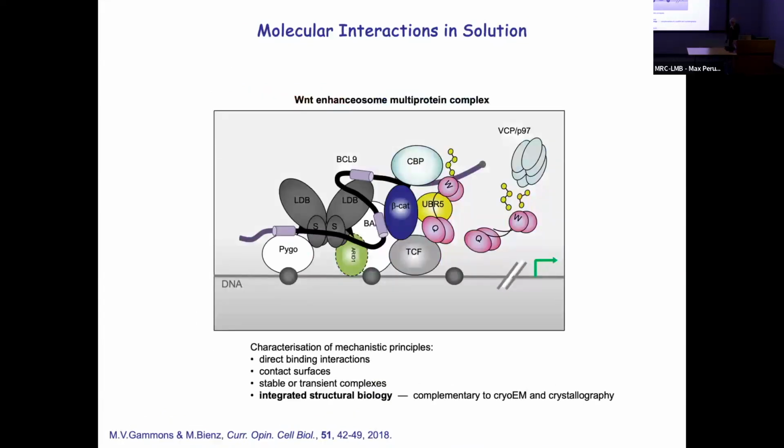So what we have to do as NMR people is push across the alternative uses for what this technique will do. The sort of thing that I'm doing, for example, is looking at multi-enzyme or multi-protein assemblies using NMR to look at isolated pairs of domains. The problem we have is as we go up in molecular weights, the quality of spectra and the complexity degrades quite quickly. So NMR is only ever really going to look at small protein assemblies. So it's highly suited to looking at individual domains and pairs of domains, interactions of isolated domains, rather than the entire complex by itself.